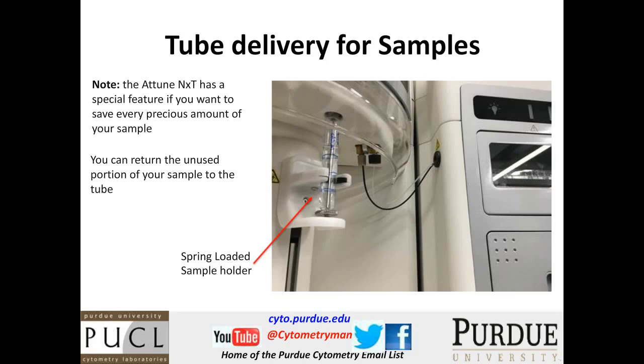I show you this picture for another reason, and that's because you see a second tube coming here, and this, of course, is where your plates are.